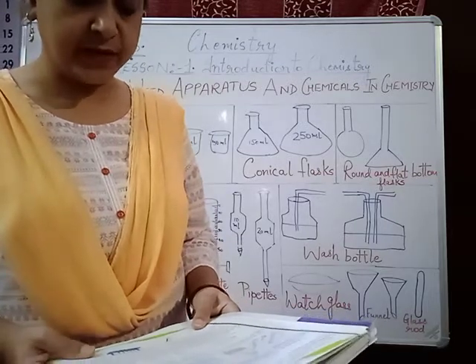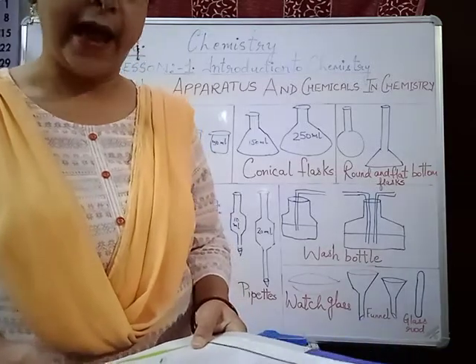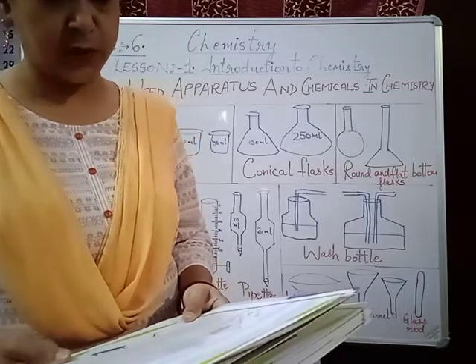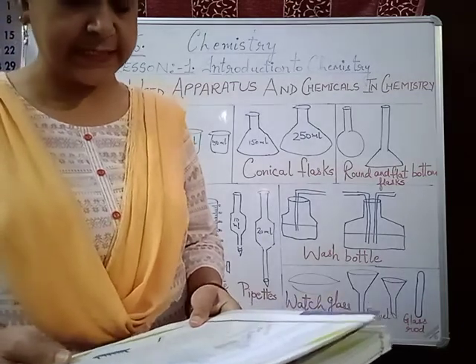Glass tube. It is a thin, hollow and cylindrical tube made of glass. It is used for transporting liquids and gases. This glass tube is used for transporting liquid. It is cylindrical in shape and it is also used for passing the gases.